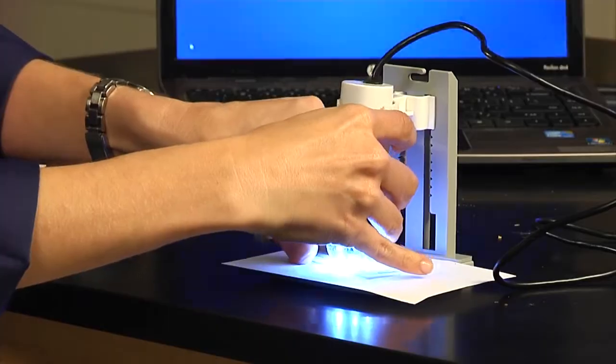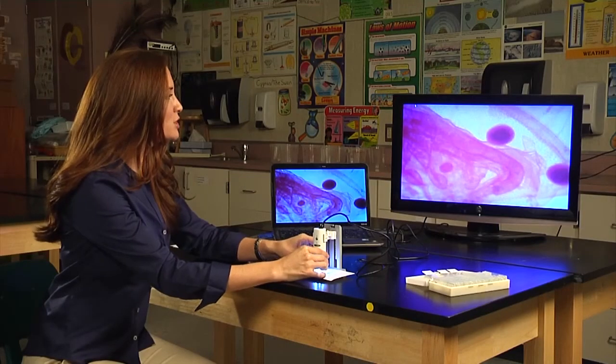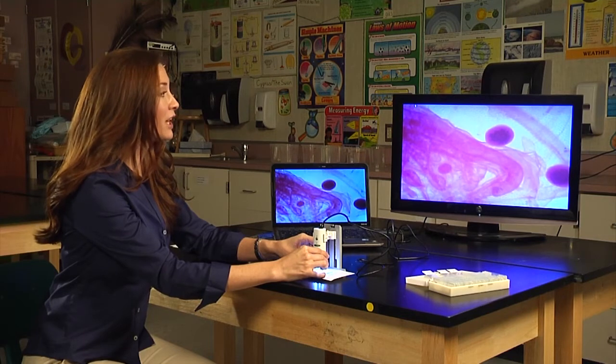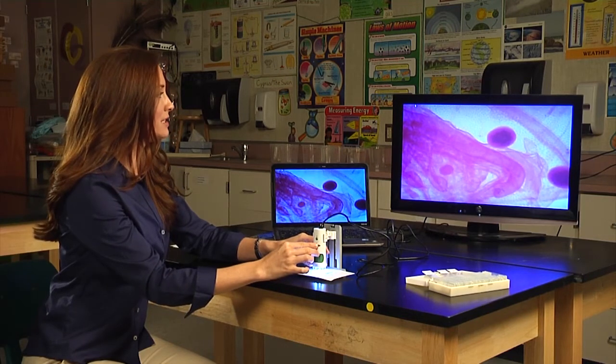Now let's take a look at Daphnia. To bring the image into focus, just adjust the focus dial at the bottom. And don't forget, you can also add light with the light dial.